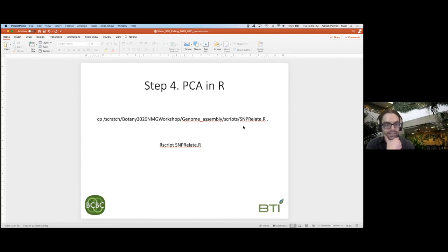And I guess the last thing that I did want to highlight with relation to that script is if you look inside it, there's an R function, and we're not going to go into a lot about R, but there's a function being used in there that is actually doing some LD pruning before it runs the principal component analysis. So it's pruning the SNPs that have been loaded into R based on their linkage disequilibrium. So assessing two SNPs, and if there is too high a correlation between them, it excludes one of that pair, right?